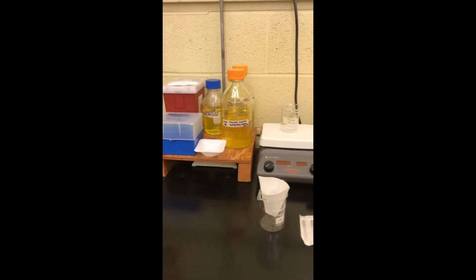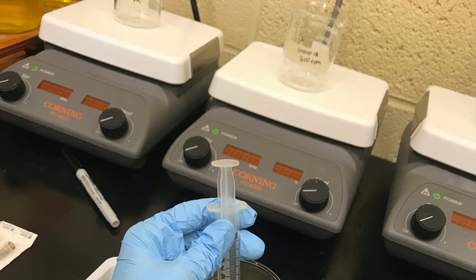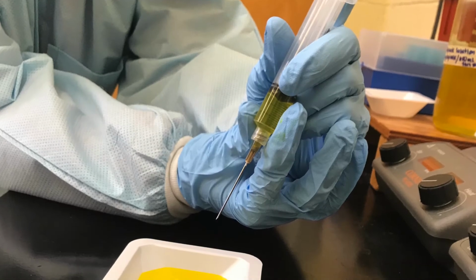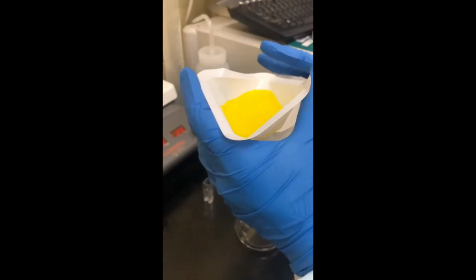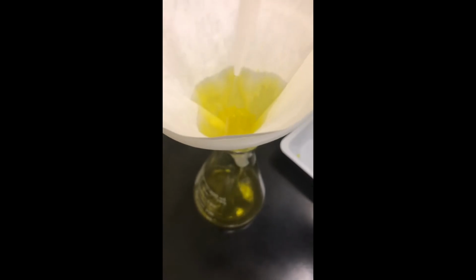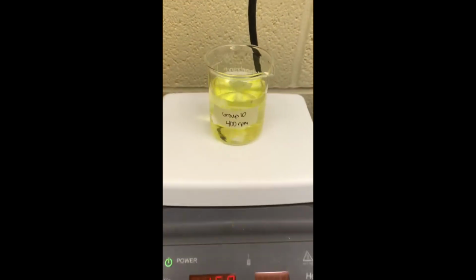The third step of this experiment was the bead production. We poured the calcium chloride solution into a large weigh boat, filled a syringe with 3 milliliters of alginate, and slowly dispensed the alginate into the calcium chloride solution, creating the beads. We let the beads cross-link for 3 minutes and then separated them from the calcium chloride solution by filtration. We rinsed the beads with DI water and then poured them into a beaker filled with 100 milliliters of DI water. This beaker was on a hot plate at a set temperature and mixing speed.